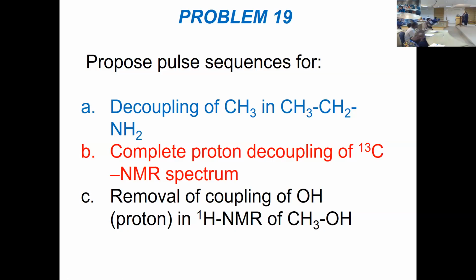So when you increase the number of scans, signals overlap, but there are noises, and you could see in your baseline that your baseline is getting thinner and thinner. That is noise. That means the noises are random, so they cannot overlap.